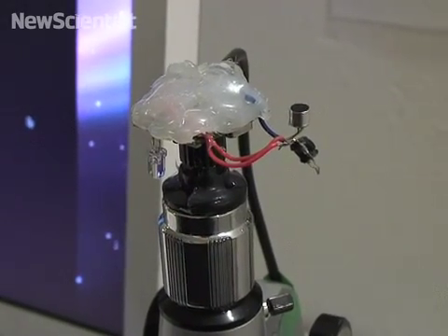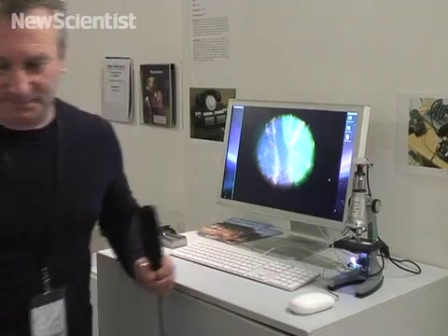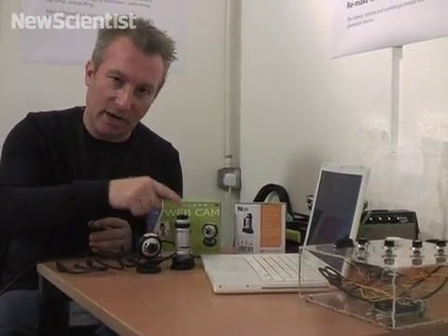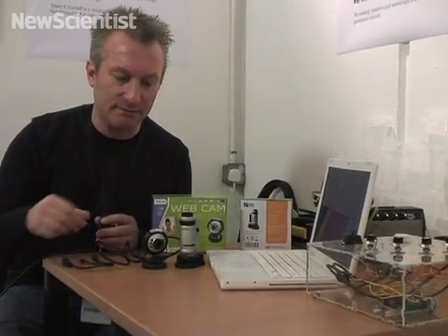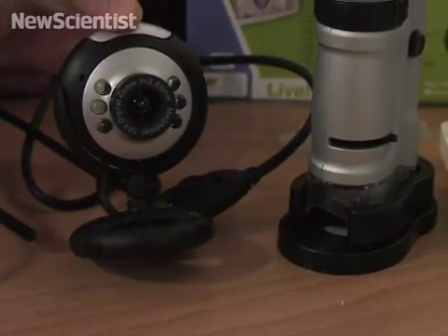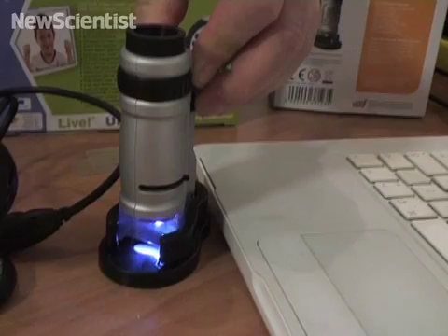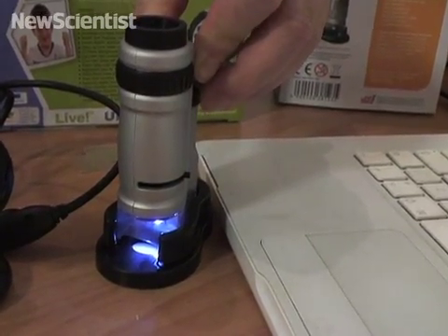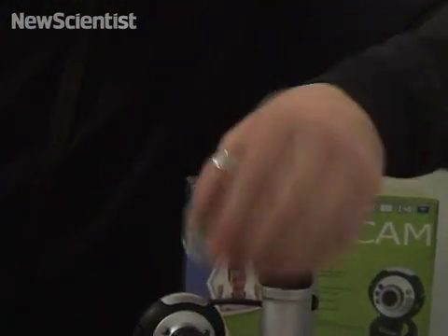It does take a little bit of time to actually dismantle the camera and add the LED in, so today I'm going to show you an even simpler method for doing that. I was looking on eBay to try and find suitable web cameras and microscopes — I was actually looking for the cheapest I could find. This happens to be a little pocket microscope from the Natural History Museum, and this is the same web camera that I used on the other microscope. This little Natural History Museum microscope also has a little LED built in. And this is just two rings of 6mm acrylic cut to size.